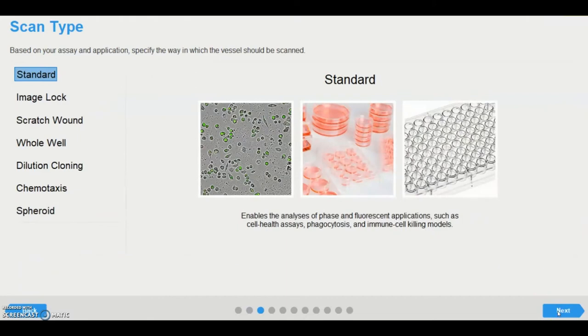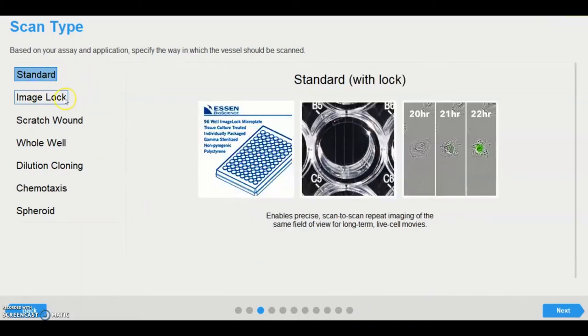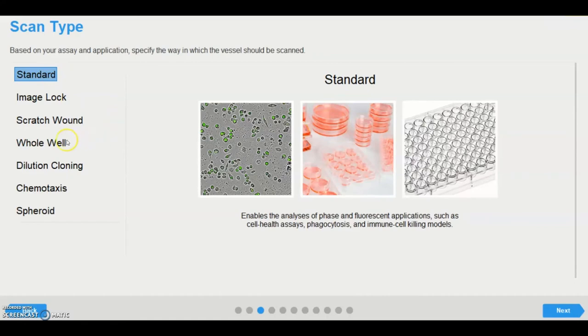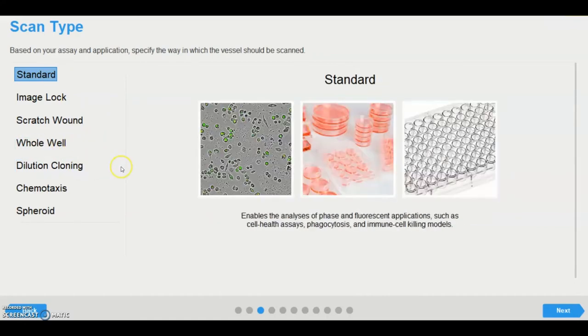In the scan type page, the relevant scanning mode, depending on the assay and application, is chosen. Different scanning modes may lead to pre-selection of objectives and tissue culture plastic specific to that scanning mode. The scan types standard, image lock, whole well, and dilution cloning are always available and functional.